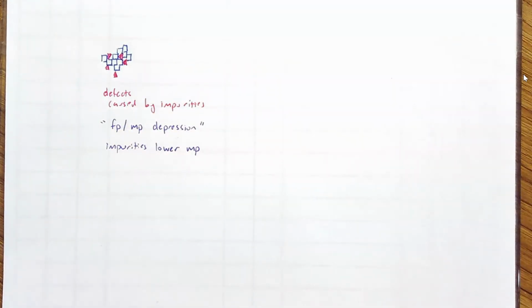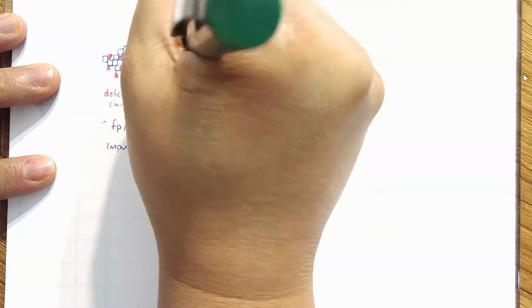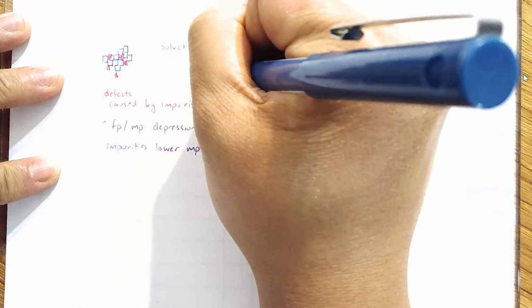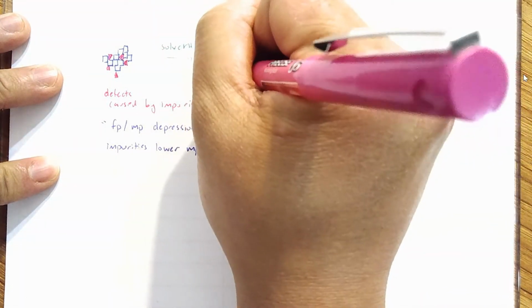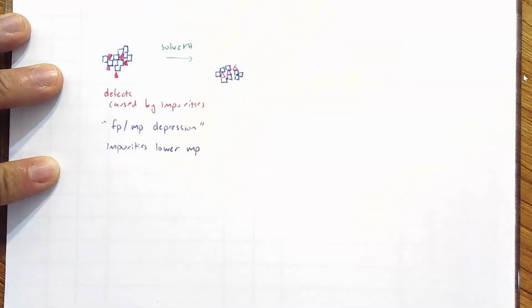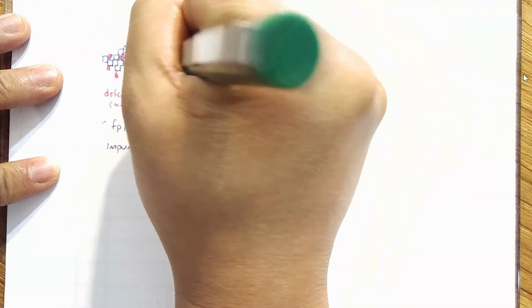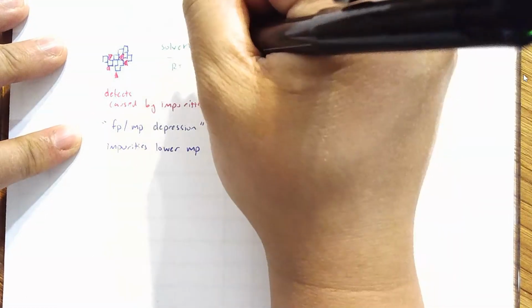Okay, so what's the technique of recrystallization? You add a solvent, and we'll make it green, and your crystals should still sink and still be insoluble in the solvent. So let me just represent that a little bit here. And you have your solvent. But this is at room temperature, RT. Can you visualize the beaker? Let me draw the beaker.